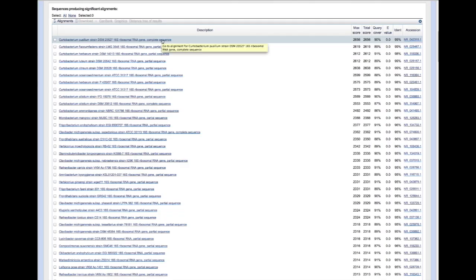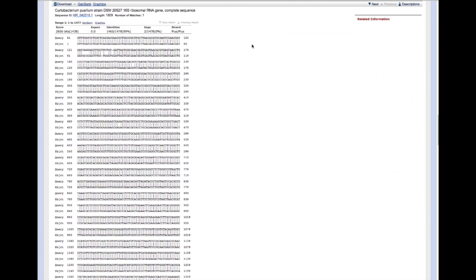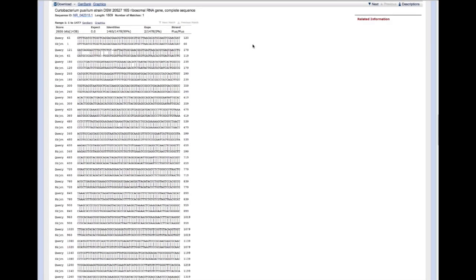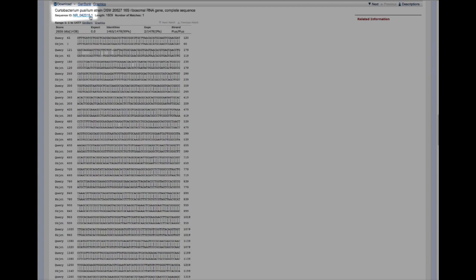It very well might be, but we need to review the evidence first. If we click on our match of interest, we can see the pairwise alignment that generated the summary data on the table. The 99% identity figure was computed from 1,465 matching bases out of a total of 1,478, which is high. The alignment looks good, and I don't see any N's or non-nucleotide letters in the sequence that could skew the identity value. We probably do have Curtobacterium pusillum, although our strain is not 100% identical to the one in the database. If you see about 98% identity or greater, there's a high probability that you're looking at a member of the same species.